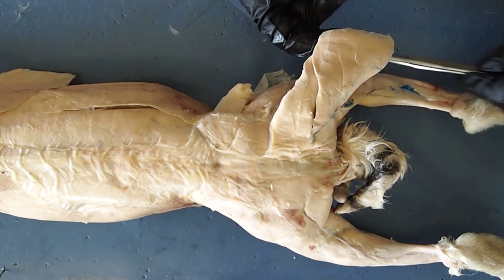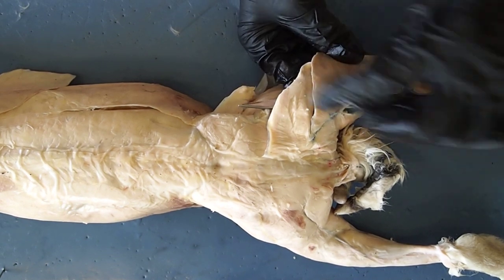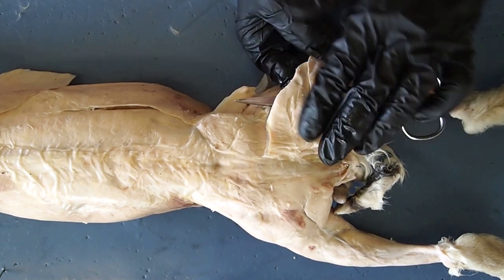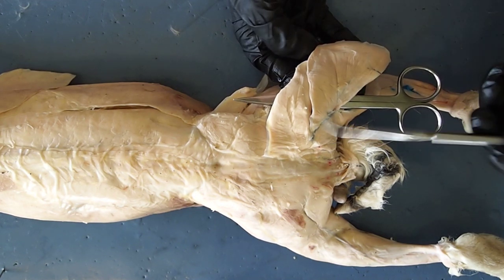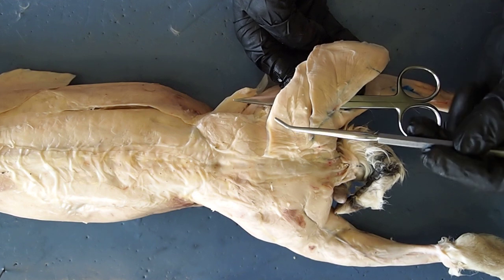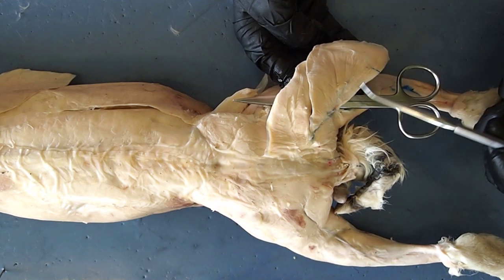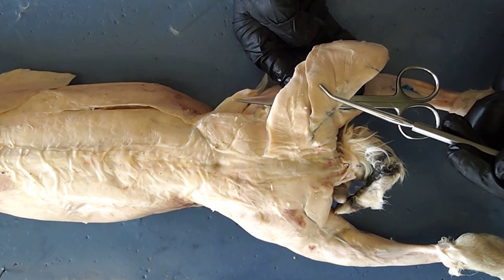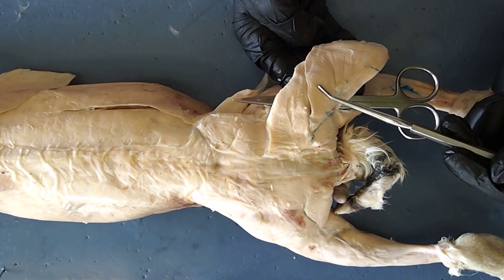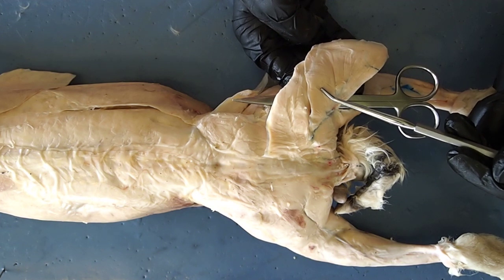One of the large muscles you're going to find down on the leg is this one here, and it is divided up into multiple heads. For our purposes, you're only responsible for knowing the full name of this muscle, which is called your biceps femoris. This is a muscle that makes up your hamstrings. So if you do squats, this is one of those muscles that you are going to be conditioning.